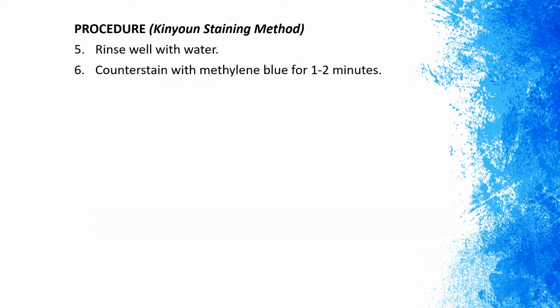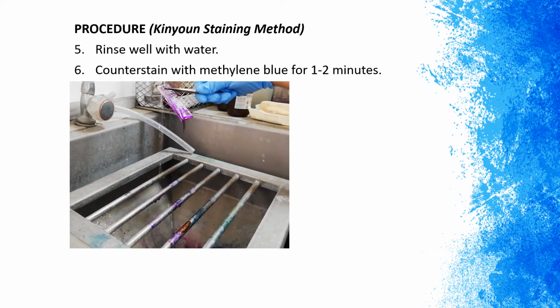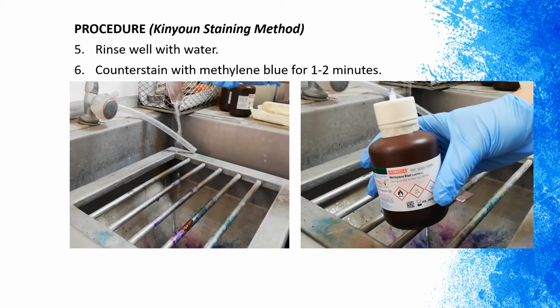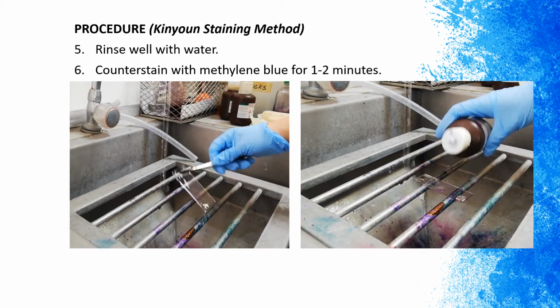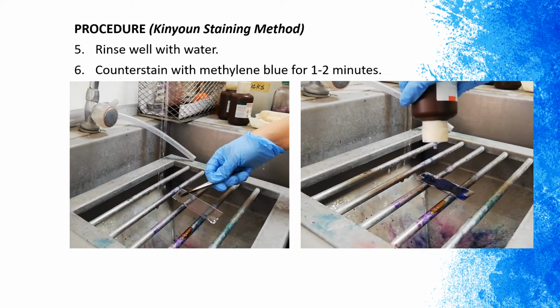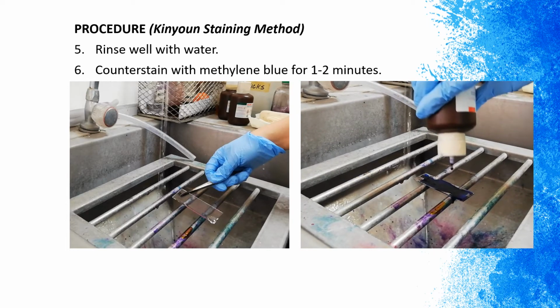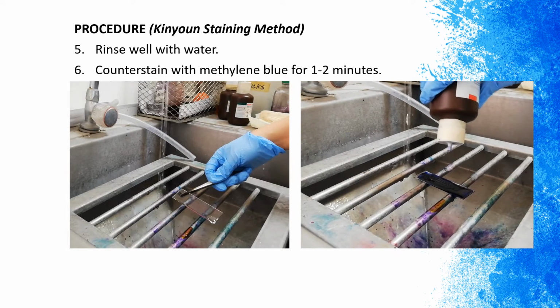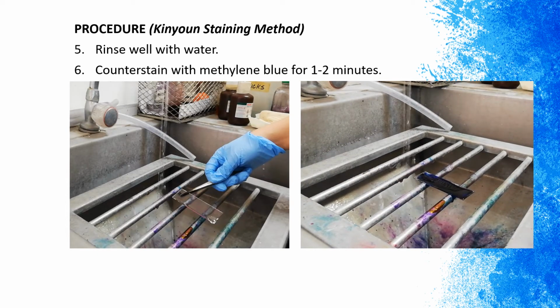Rinse well with water and then counterstain with methylene blue for 1 to 2 minutes. If methylene blue is not available, you may also use malachite green as a counterstain and let it stand for 1 to 2 minutes.